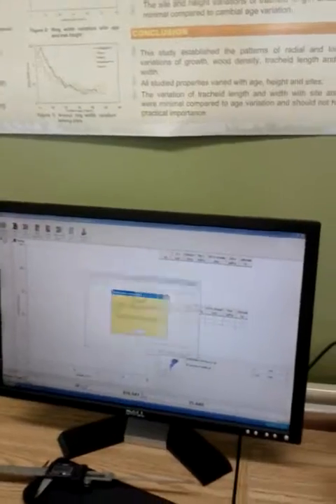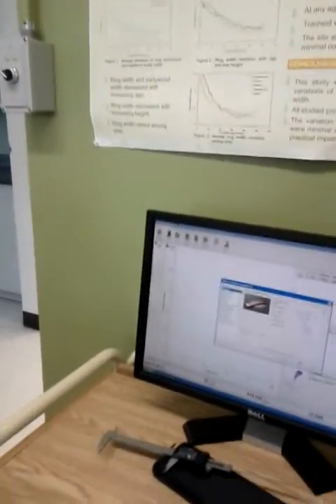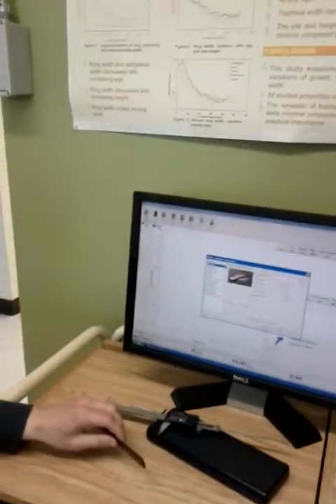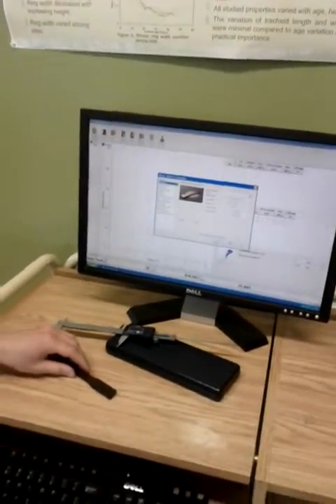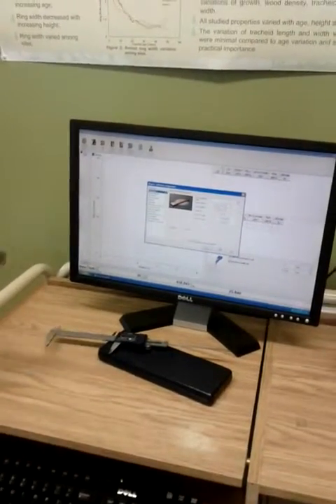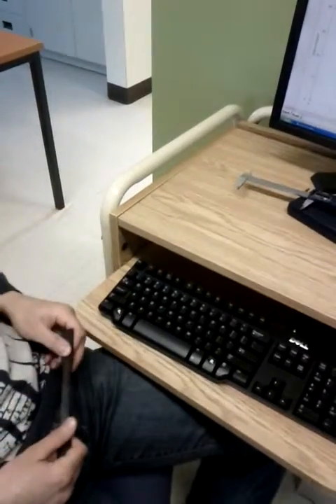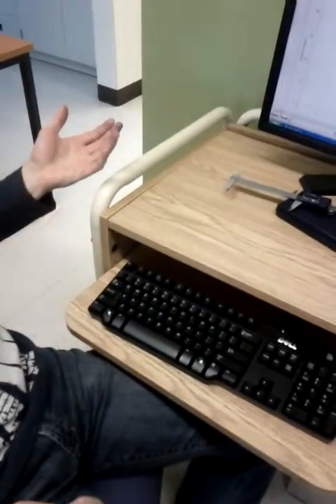So what is the speed of movement? It's 5 millimeter per minute for this, but it depends on the standard, and it also depends on the sample. You have to adjust to each type of material. If you're testing wood plastic, it's not on the same speed as if you test plastic.